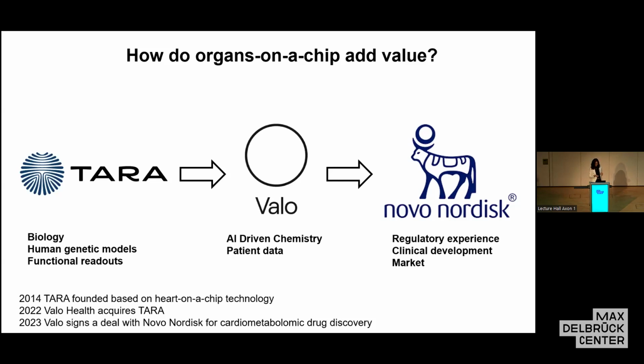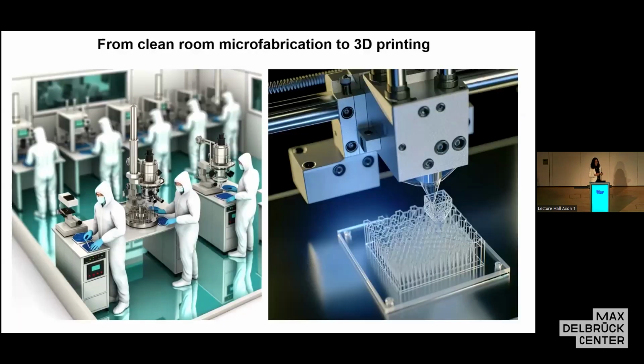So most of the early organ-on-a-chip prototypes, you'll see that most of the devices are made by hand and operated by a skilled operator. I think in most labs, that's how we still operate. A postdoc or PhD student is very skilled, they know how to operate these devices. And there is a really big incentive now to move more towards automation and scaling up production, both device production and operation of the devices.